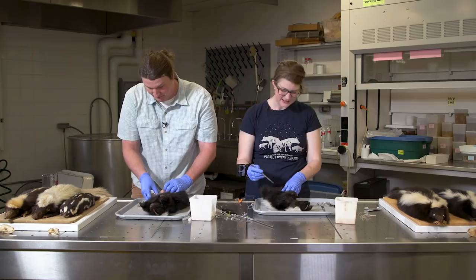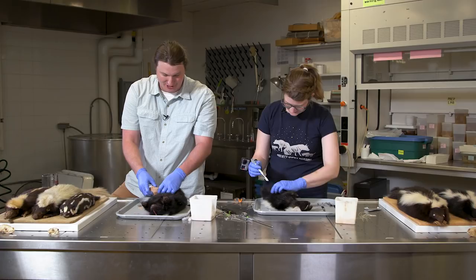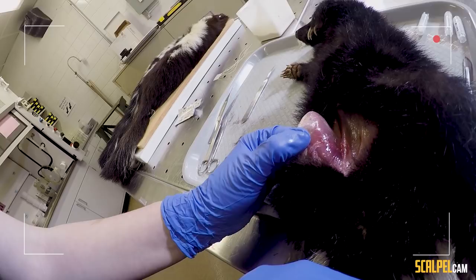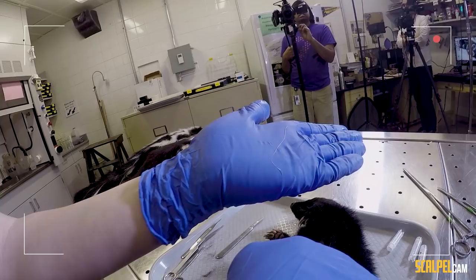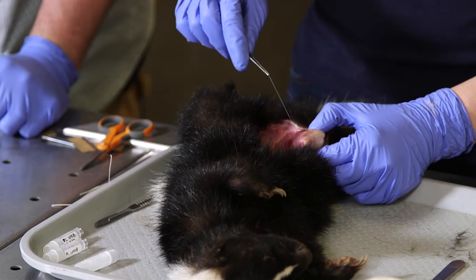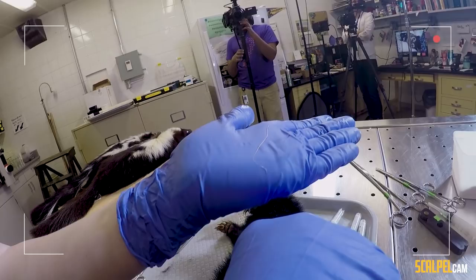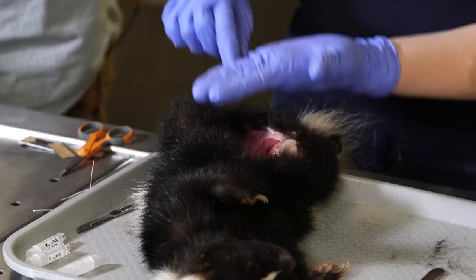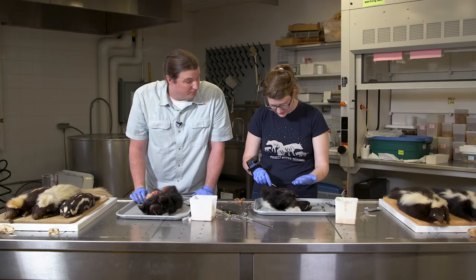I think he's got a parasite — cuticular parasites in the subcutaneous layer, between the skin and the muscle. I found one, and it keeps going — that is pretty gross. I think I've got a couple over here too. Is that maybe why he's so malnourished? It could be — high parasite loads are usually a sign of poor health, whether it's the cause or the correlation.